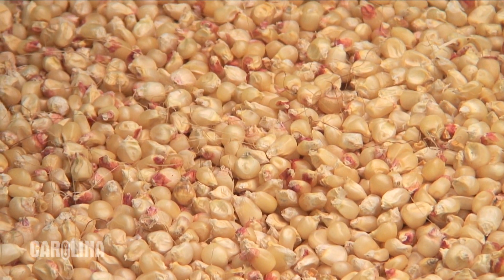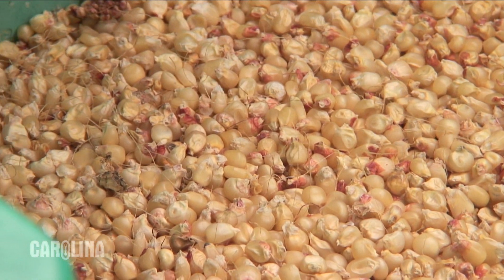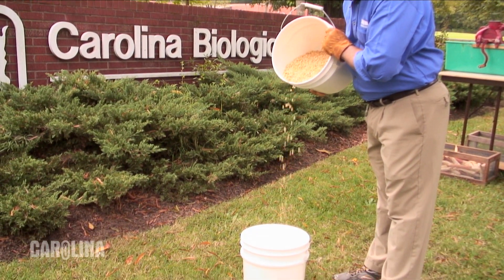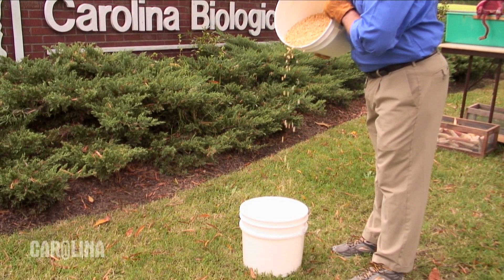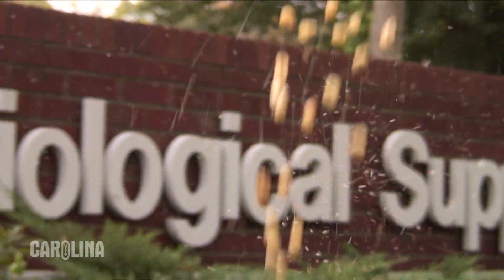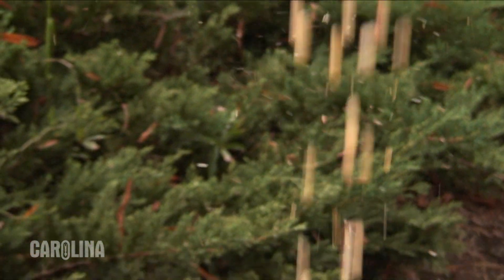Next, we have to clean these kernels. There are small pieces of cob, insect larvae, and insect eggs that are not suitable for long-term storage. So we need to be able to separate that from the larger kernels. To do so, we'll use a two-bucket method where we'll pour the kernels into one bucket and allow the wind to carry the insect larvae, the chaff, and the eggs away.